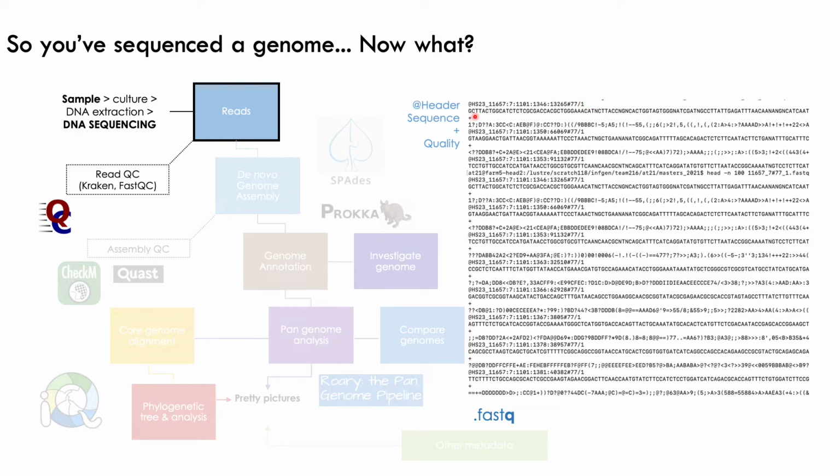The second line is the actual sequence, so a series of G's, C's, T's, and A's. Our third line has the plus symbol, so we're adding the sequence and the quality together. The final fourth line is the quality line. This looks a bit messy. It has what's called Phred scores, and that's from 1 to 40. But you can't put 1 to 40 in these lines to match the individual bases.